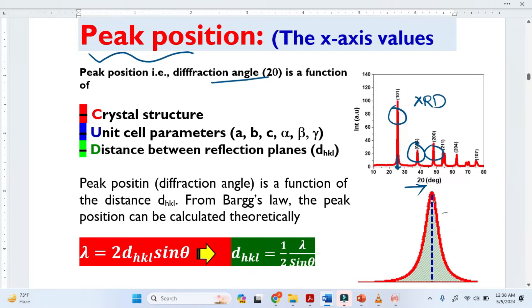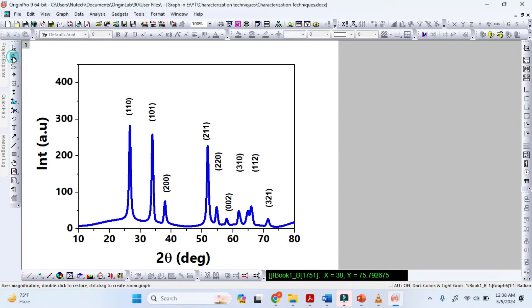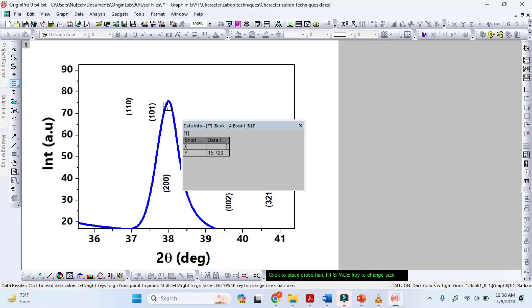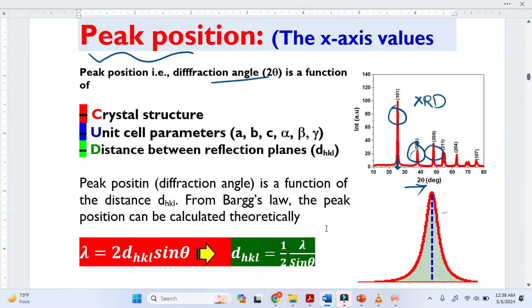I just magnified this peak here. Let me show you in Origin software. This is the graph — when you open the XRD pattern in Origin, you just take the scale and zoom in. Then take the data reader tool and click it exactly on the top of the peak. It will give you the value. The 2θ is basically 38. This is how easily we determine the peak positions.